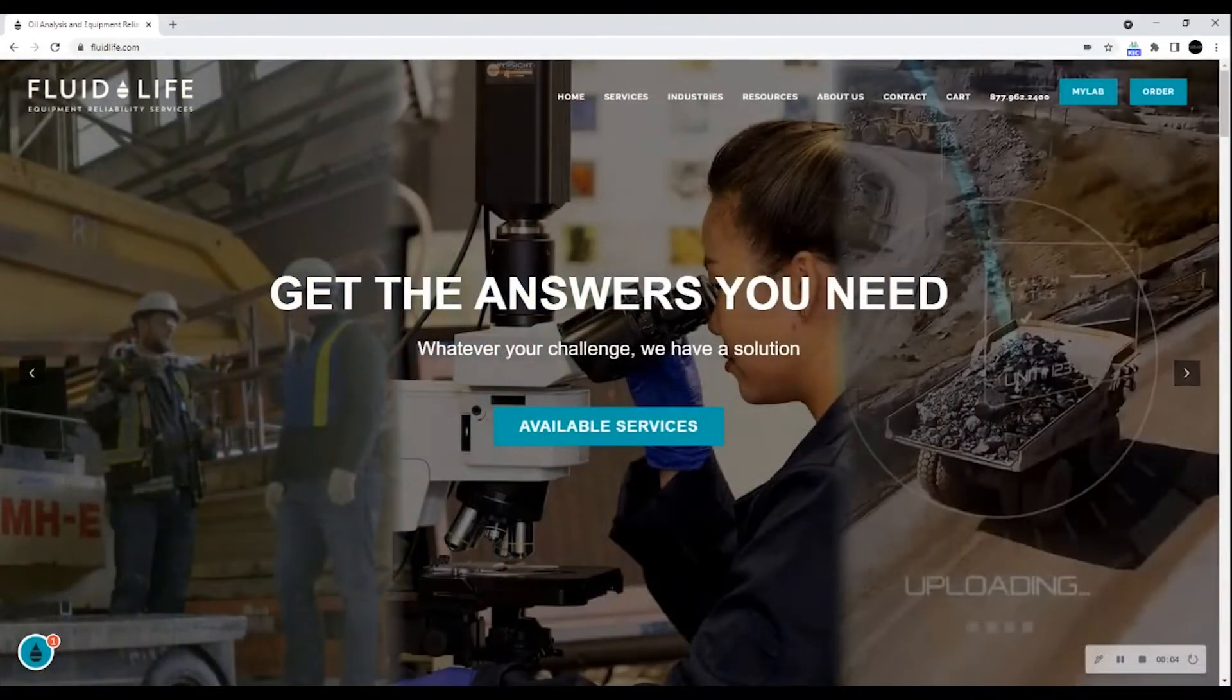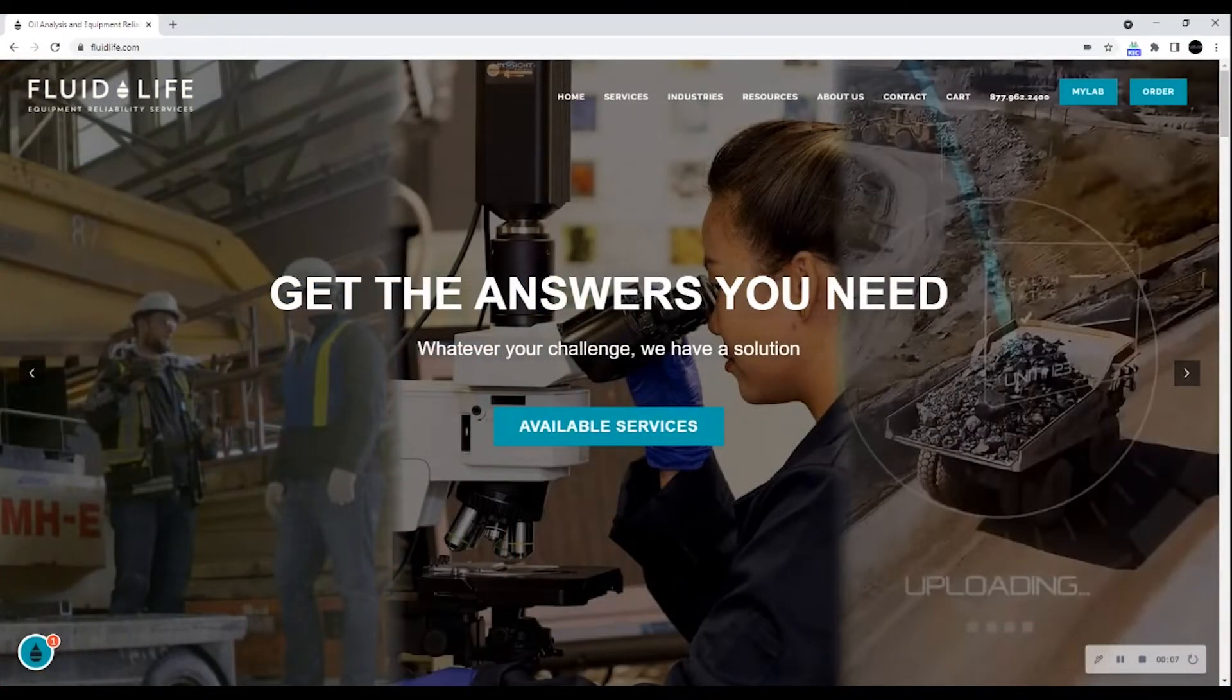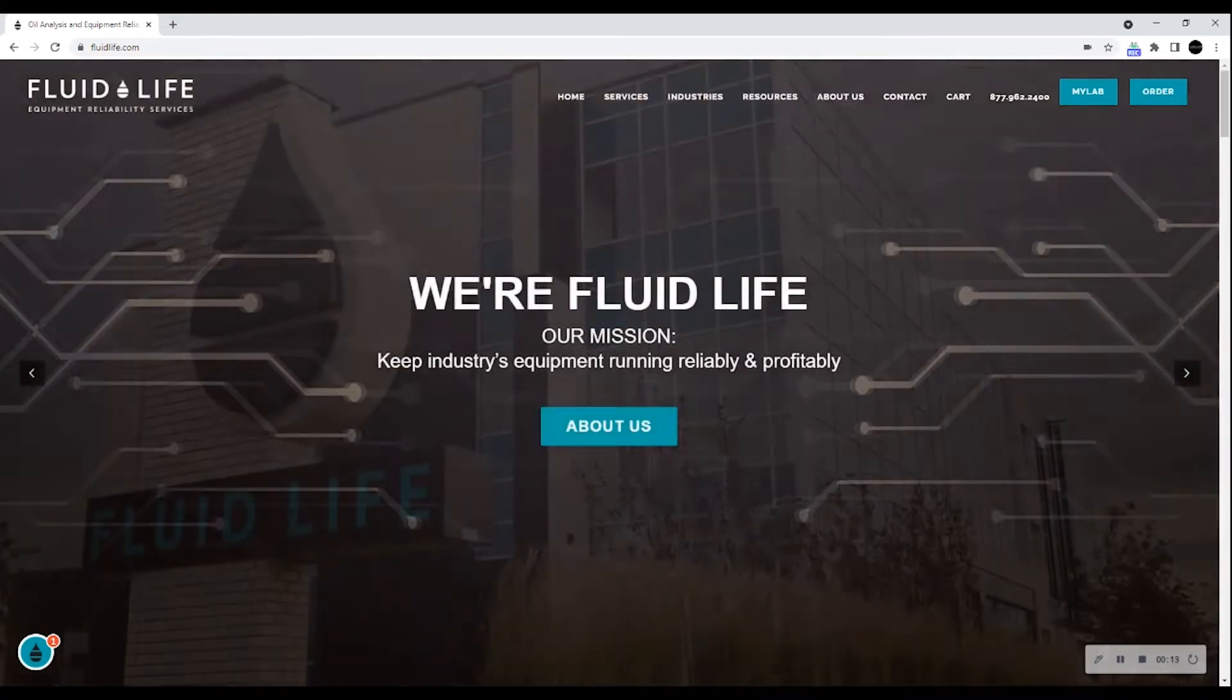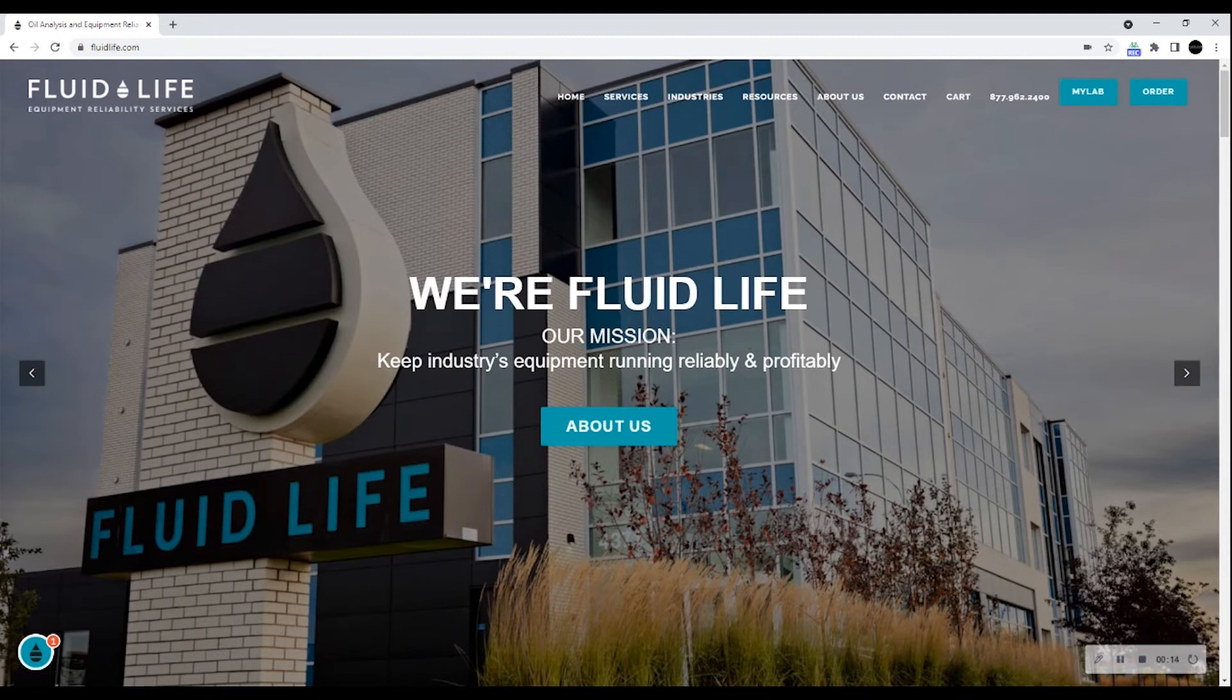Welcome to the Introduction to MyLab. MyLab is a state-of-the-art software for viewing oil analysis results and for displaying valuable information derived from those results. You can access MyLab from any device with an internet connection, including mobile phones and tablets.